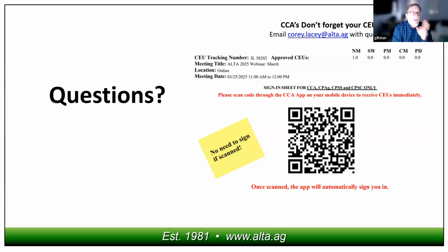Yes, the quick answer is yes. You can run with an internal standard. It's super easy, and I would have gone into it, but again, I was concerned that I was going to talk too much, so I tried to cut some stuff out. An internal standard is basically a known amount of an analyte that is not in your samples, and is not something you're looking for. You add that to your samples, and in fact, I always add it in line.